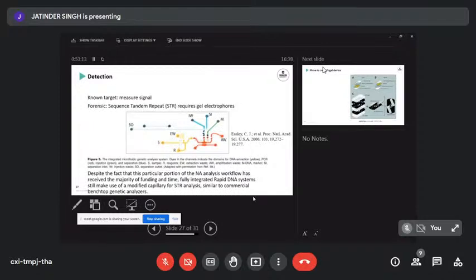So the very first device, and I like putting this in because I told you James started doing his gel electrophoresis. Pretty sure I saw him doing gel electrophoresis in 2001. They made it to an integrated device in 2006. This is the Landers Group, PNAS, great journal. We thought as a community we were almost there to do complete STR profiling on the chip.